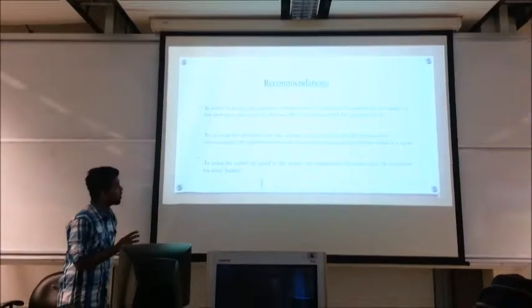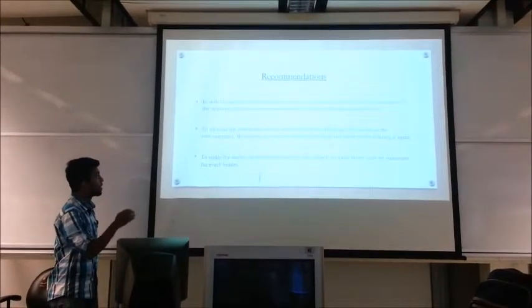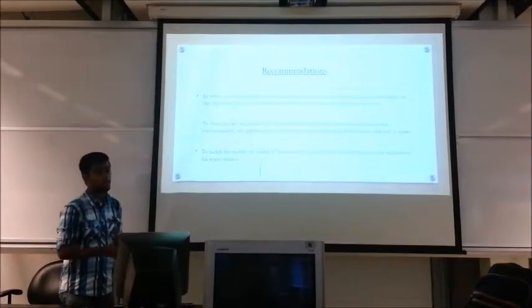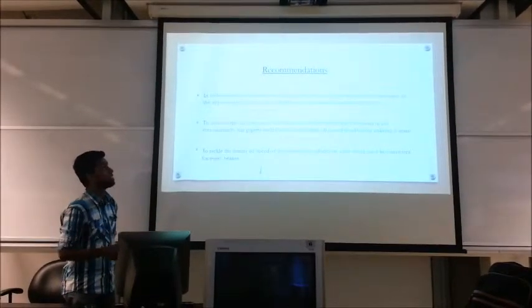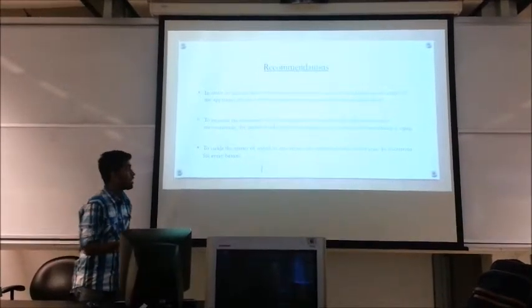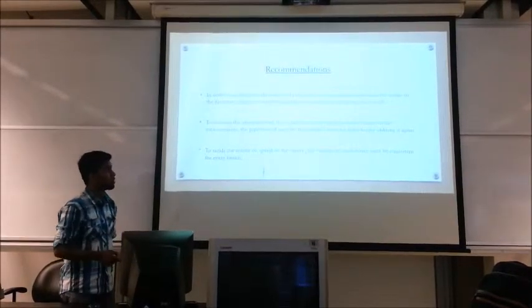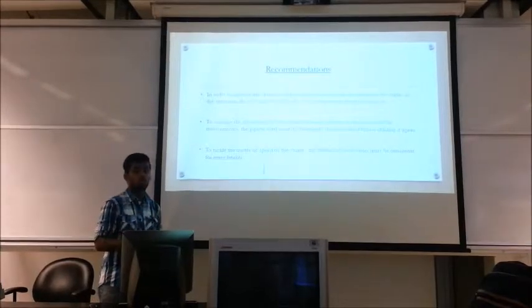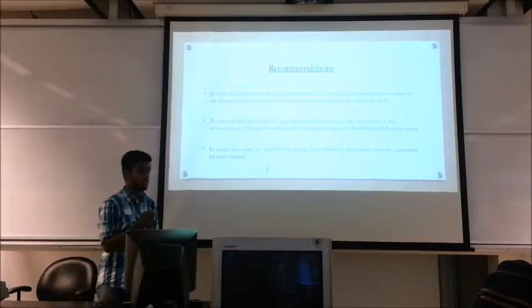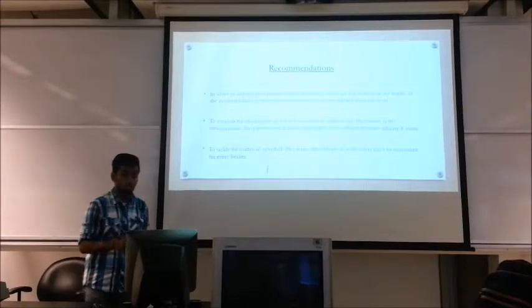Since we have some errors, we have to give some suggestions to improve it. When talking about the marks that we are observing using naked eyes, in order to increase the closeness and the preciseness of measuring the reading on the marks of the apparatus, the eyes must be precisely in line with the meniscus level. Besides that, in order for us to measure the absorbance of the solution exactly without any fluctuations in the reading, the pipette used must be thoroughly clean right before utilizing it again. Finally, to tackle the speed of an old machine such as the stirrer for this experiment, the velocity of the stirrer must be consistent for each and every beaker.